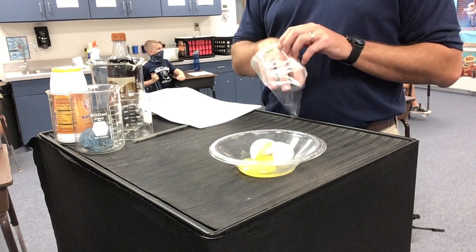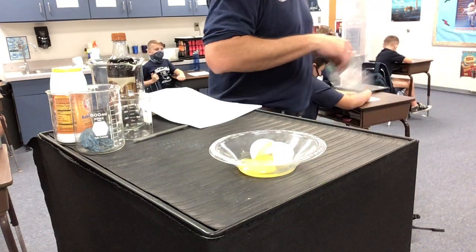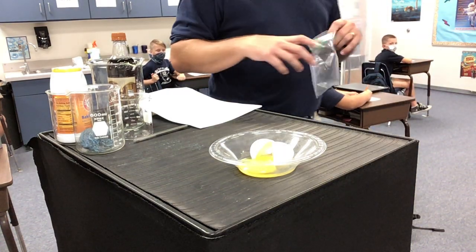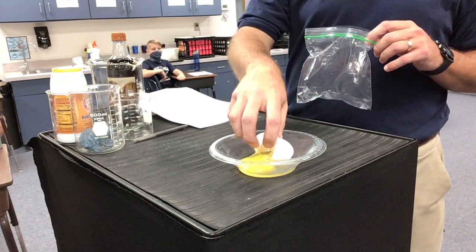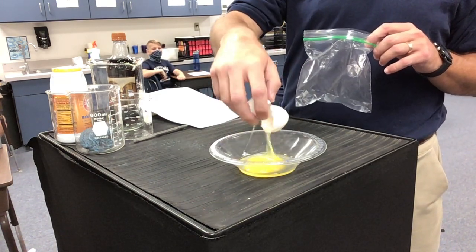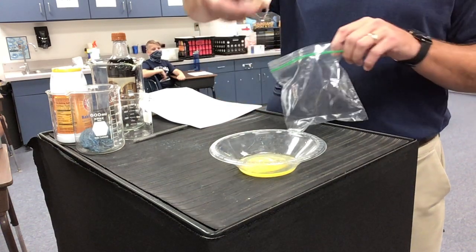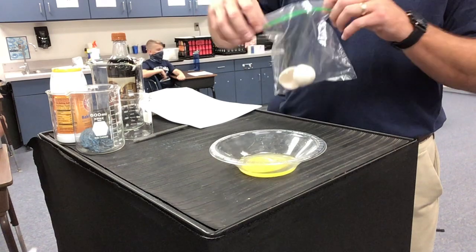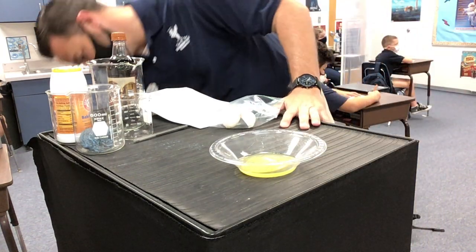All right, while you finish that, I'm going to go ahead and go to the next one. Our next one says, put these shells, I'm going to take the shell of that egg that we just cracked up, take the shell, put it in a bag, and I'm going to add some vinegar.